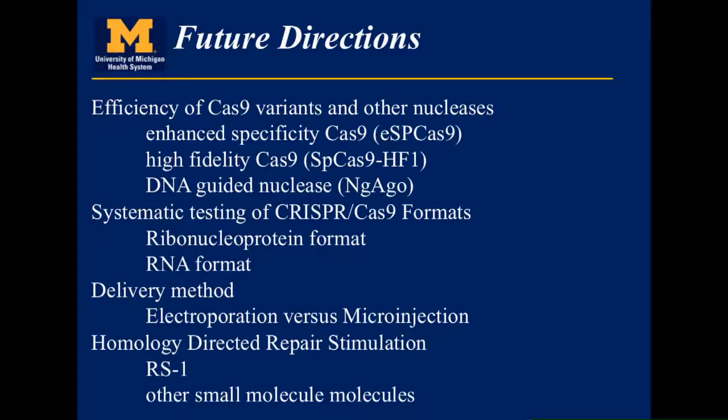And I was talking to Gaetan Borgio, who has a talk later today, and he showed me some interesting preliminary data with Argonaute. So next year, we may be giving the same talk with a different nuclease, because there are some advantages in being able to target GC-rich templates, and we don't have the limitation of a protospacer adjacent motif telling us where we can cut.